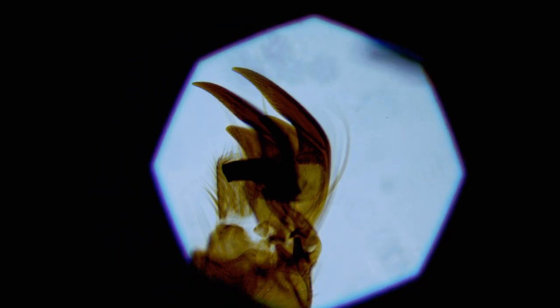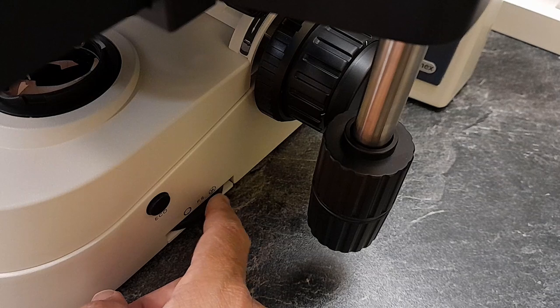The microscope has a so-called field diaphragm. The field diaphragm is able to restrict the light only to the area of the specimen which you're actually looking at. And this prevents overheating of the specimen and the Kohler illumination also ensures that you have a very even illumination and you also therefore have less stray light and this makes it very suitable, especially if you do photography or videography work. The Kohler diaphragm can be adjusted by turning a small wheel on the right side in the base of the microscope.